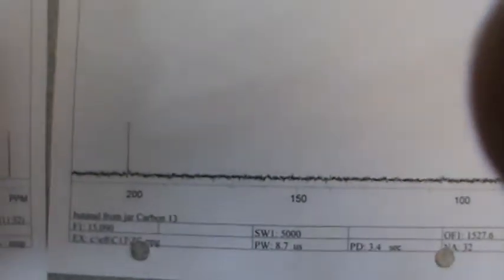This is the product. We expect to see something down near 200. Sure enough, we do. That's your carbonyl carbon. All that's left should be 3. You see one just below 50, and then 2 more. And it will follow in succession, right? So the one that's at 46-ish is this one. And then as you're heading right, it'll be that CH2, then the CH3. And that as well will be located on SDBS, I'm pretty sure.